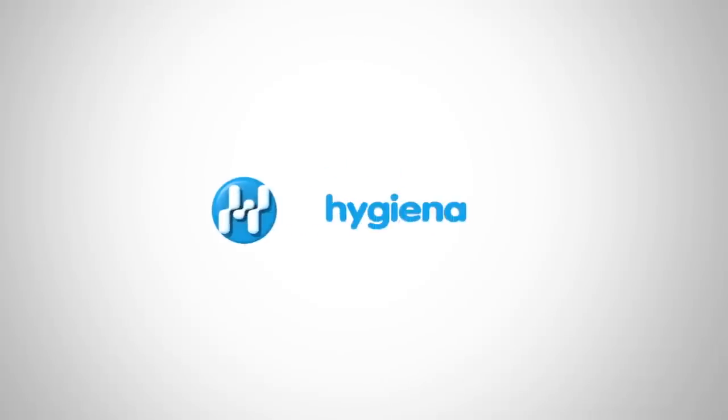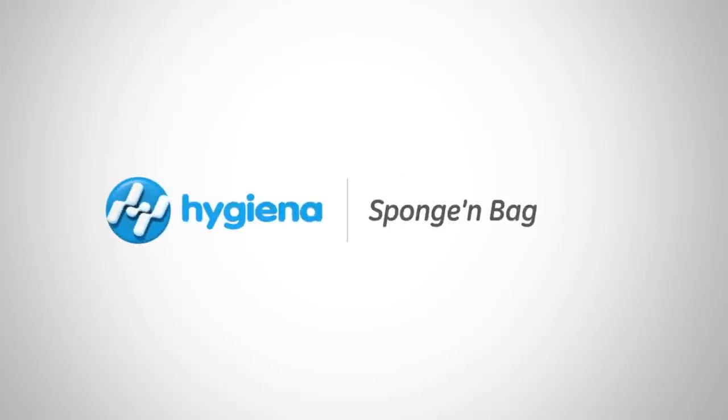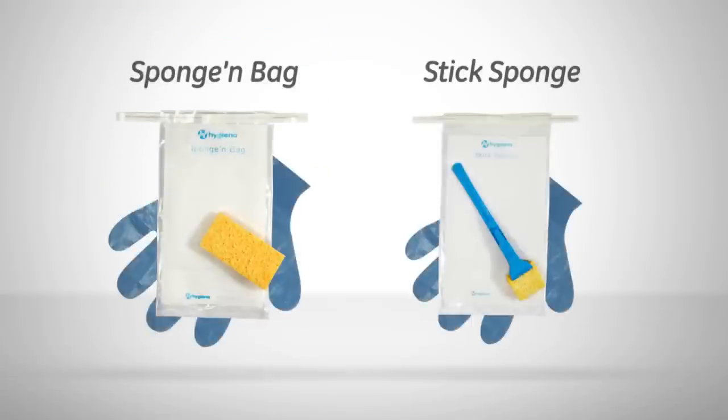Welcome to Hygiena's instructional video on the proper use of sponge and bag and stick sponge. Hygiena sponge sample collection devices feature biocide-free cellulose sponges supplied in a sterile leak-proof tie-off bag.